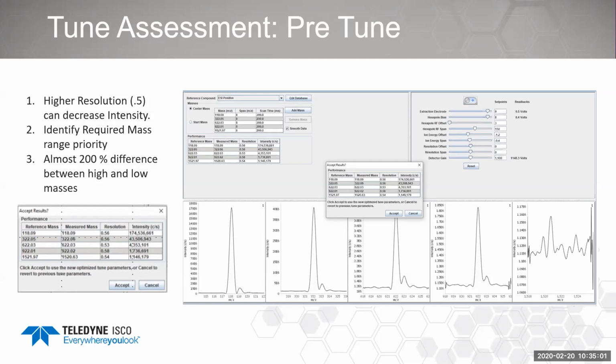Are there any other questions? Actually, I guess we do have some. What is the expected flow of it? A very good question. So we actually have two different flow rates right now. I would like to optimize this a little bit more. So my role actually is more tech support and applications. So one of the things I'm trying to work on literally as I'm out here in Lincoln is coming up with some ideas for that.